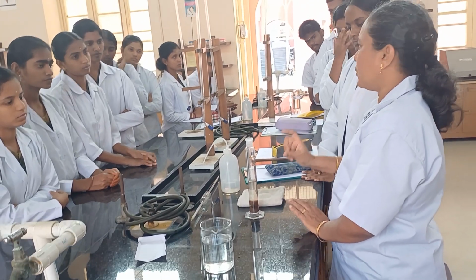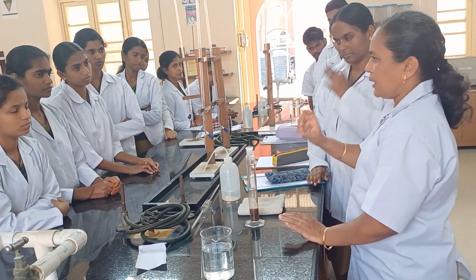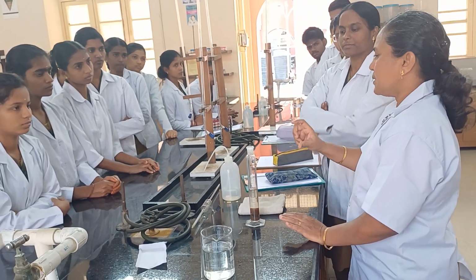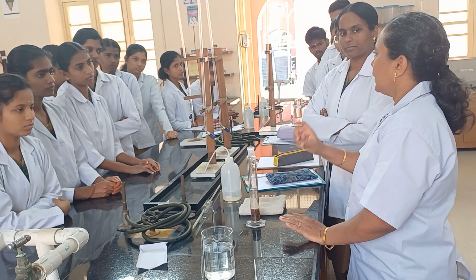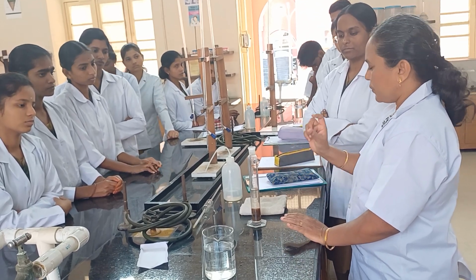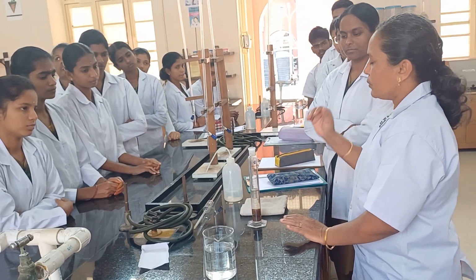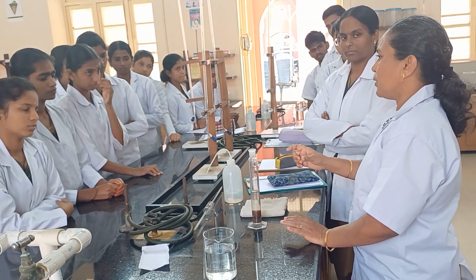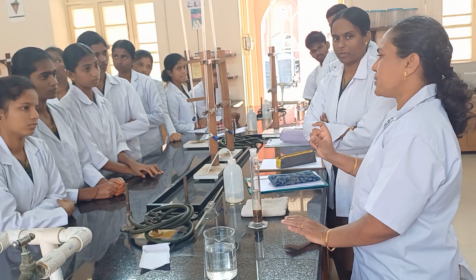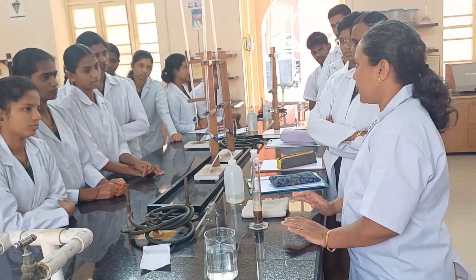How do we calculate the pore volume? V3 and V4 we have. V3 is V1 plus V2, 67 ml. V4 is the volume at the end of the experiment. So V3 minus V4 will give the pore volume. Soil volume minus pore volume gives the volume of soil solids. Weight by volume of soil solids gives the particle density.